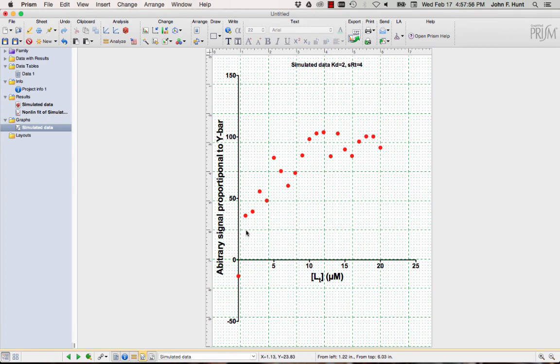I'm going to ask it to analyze and get the probable values of B and delta. So there are two more degrees of freedom here. The reason is that I don't know exactly what the baseline value is because it has noise, and I don't know exactly what the saturating value is because it has noise. The best thing I can do statistically is to use the mathematical apparatus I have in place, the curve fitting methods, to get the most probable estimates of those.